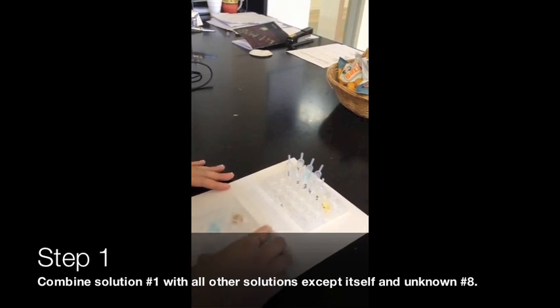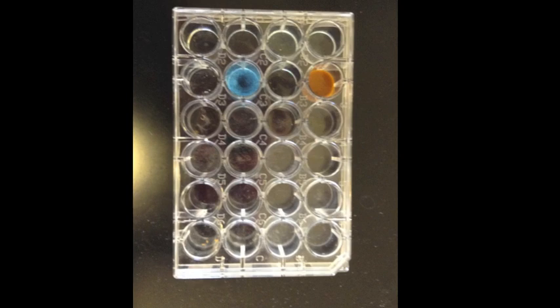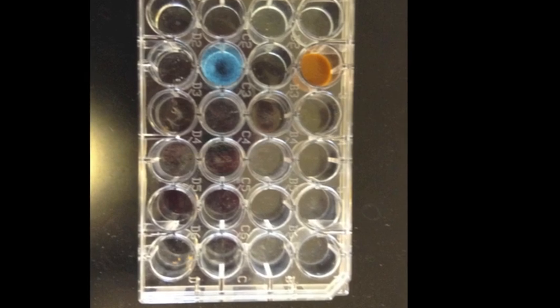When mixed with solution 9, a blue precipitate formed. These solutions are sodium iodide and potassium carbonate, respectively. Since solution 1 only reacted with 2 other solutions, it is copper(II) nitrate.